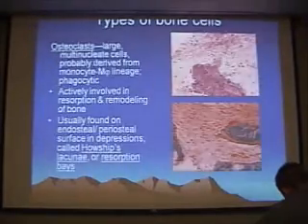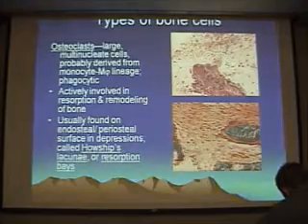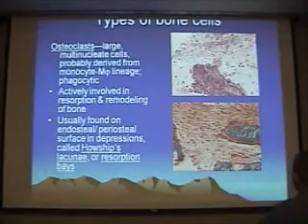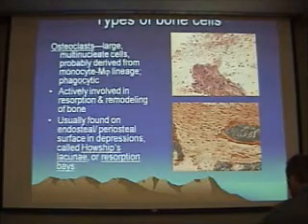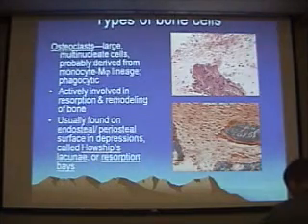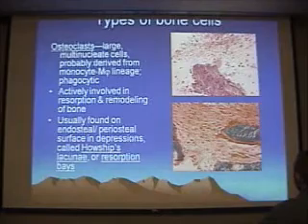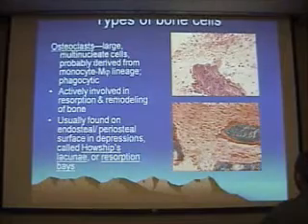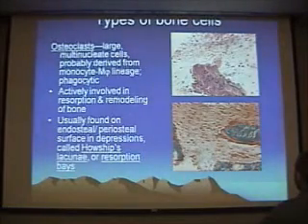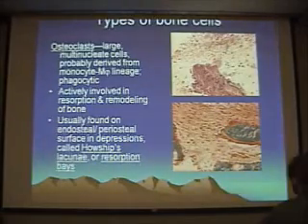And that's just more osteocytes. Now, in addition to osteoblasts, which secrete bone, we also have osteoclasts, which break down bone. Their job is to chew up bone so it can be remodeled. And so the osteoclasts are very large multinucleate cells, part of the monocyte macrophage lineage. And here we see one in H&E, and here we see another one on a special stain.